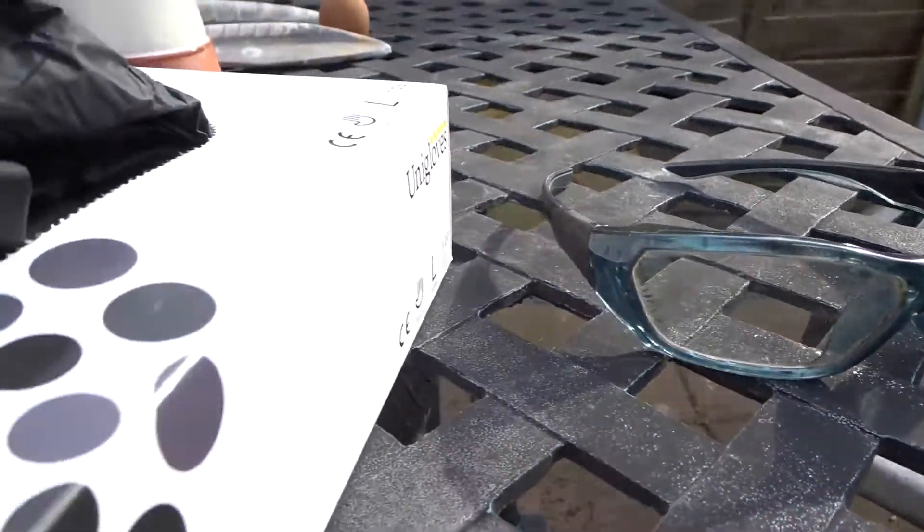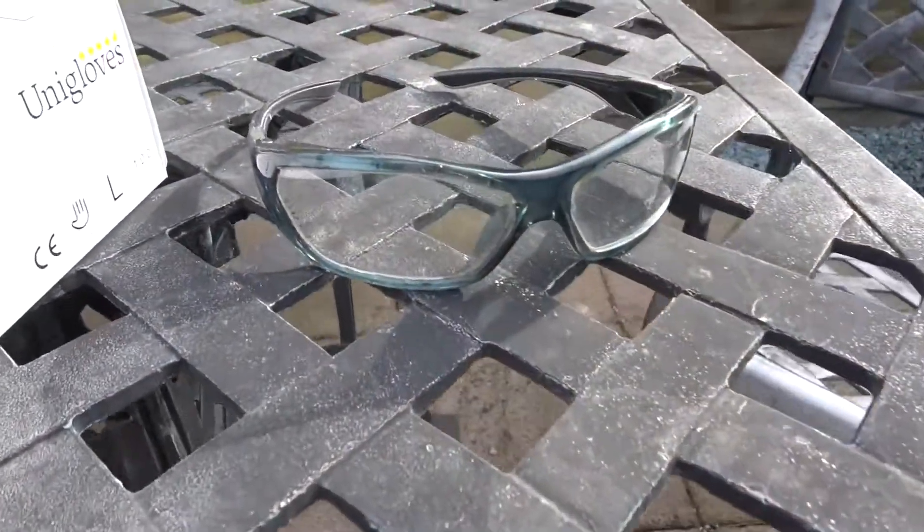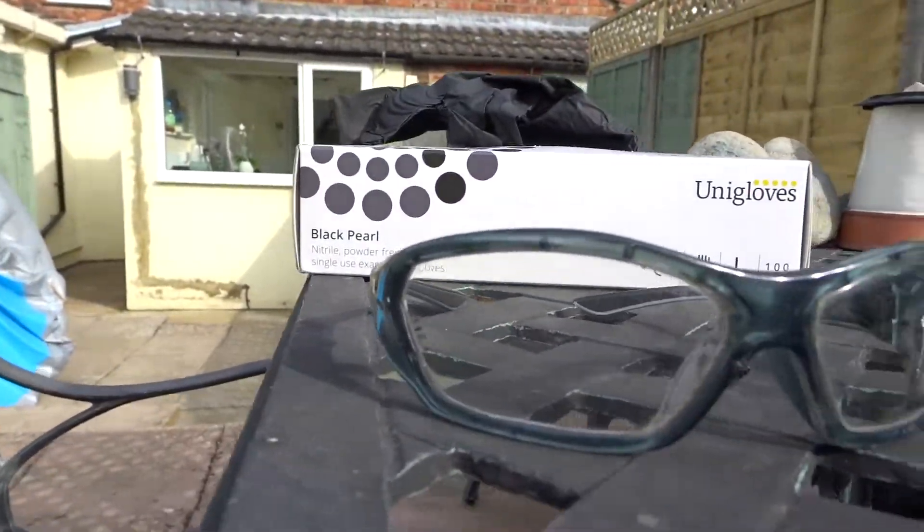Next, you're going to need goggles. You can use any goggles you want, really. I use these cheap eBay ones. You can, of course, use more expensive ones, but all we're looking to do is put a barrier between us and the alcohol.